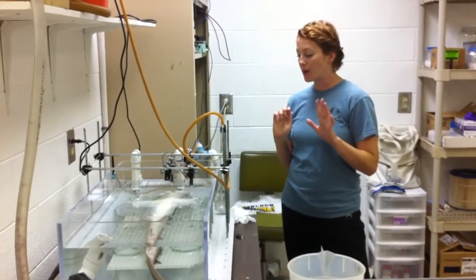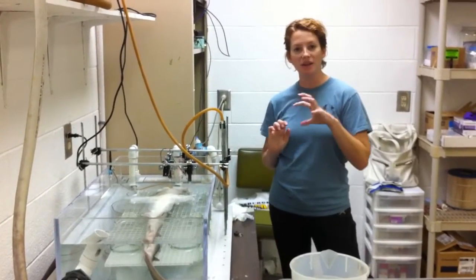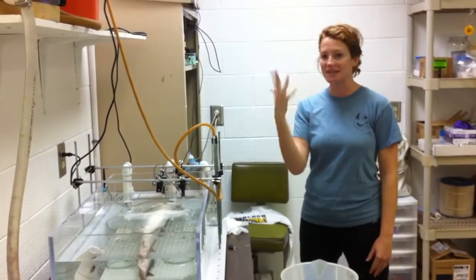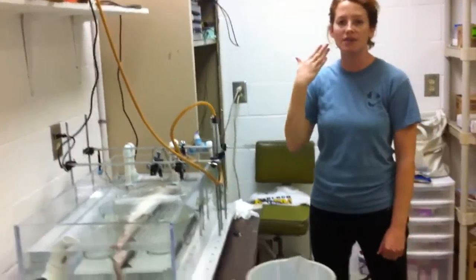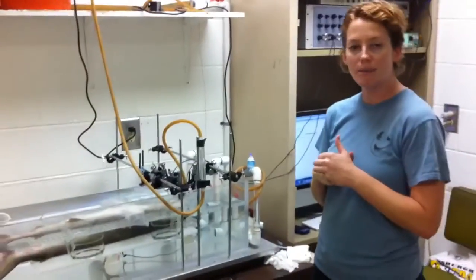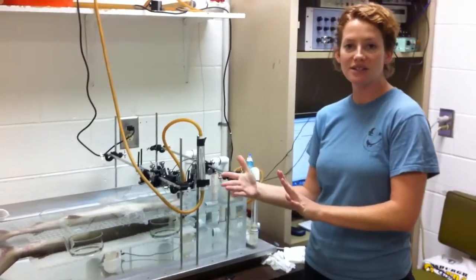What I'm doing now is I'm switching that background seawater to a really strong odor. So it's like if you walk into a perfume store and it's really strong. And you stop smelling perfume after a while, but it's still there. It's still in your nose, binding to receptors. Your brain has just shut off the signal. It's because your nose is adapted with perfume. So I'm adapting their nose with a really strong amino acid. And then over top of that background flow, I'm trying different odors.